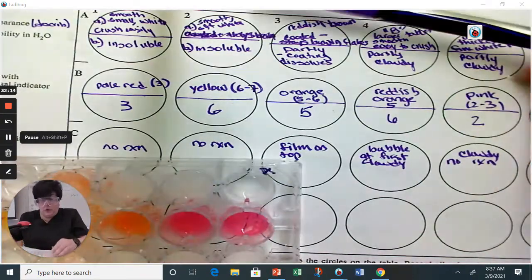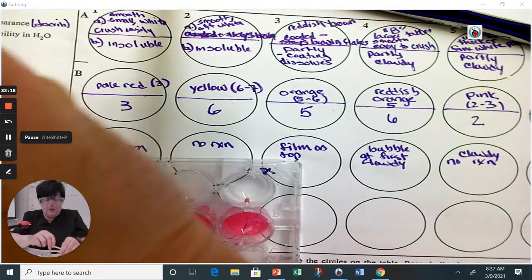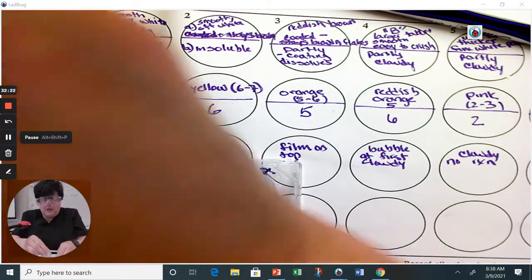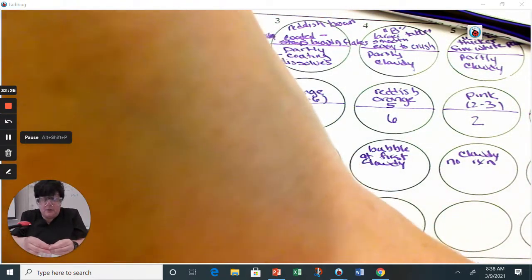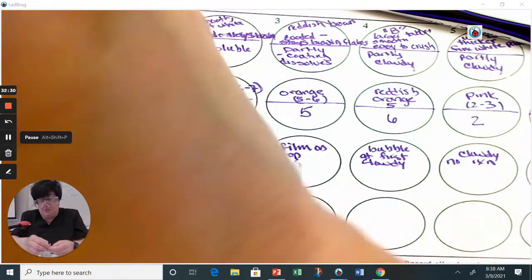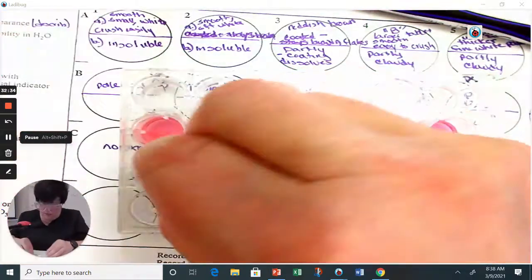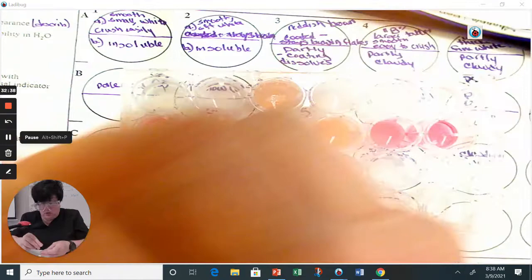Now I'm going to do another quick check on pH to see if there's a big change. A lot of them might just be very acidic. And this may not work because if the material that's supposed to neutralize the acid has been around a long time, and these have, they've been sitting in bad conditions over the summer because they don't keep the conditions. These are going to be really dark. So that's like a pH of 1.